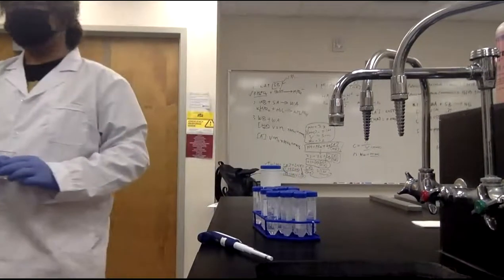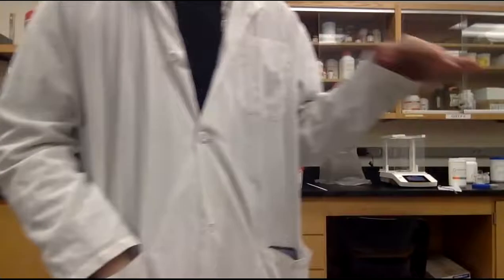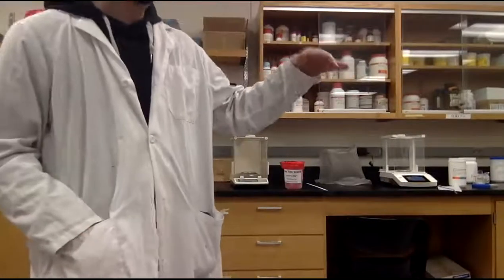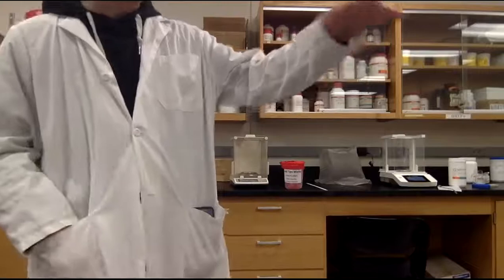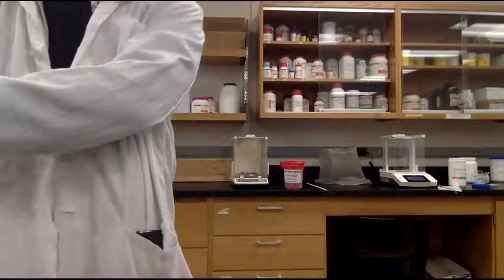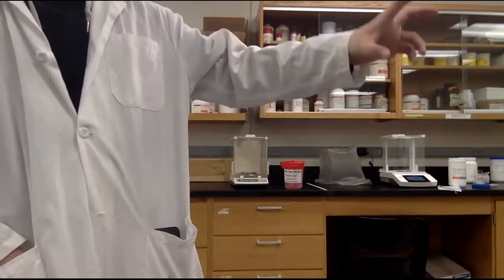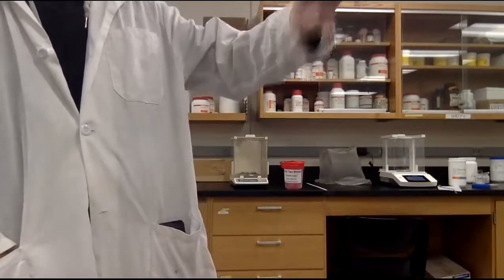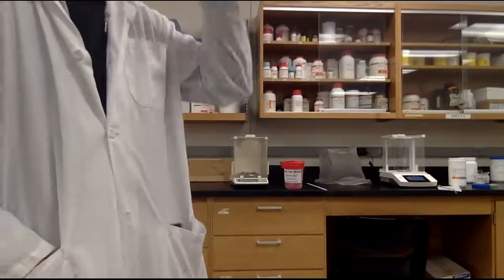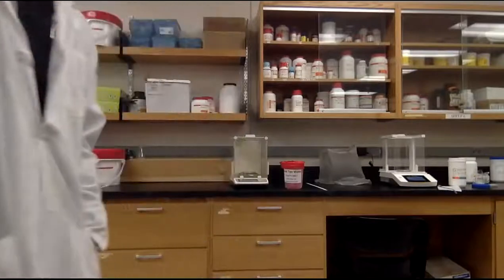So now you just start adding water to it until 50. You are not measuring the volume by the line of the beaker. What you need to do is add the water to about 40 mL on the beaker that you can read. Then you use the glass stir bar to dissolve all the powder in the solution. Then you pour all the solution into a graduated cylinder to measure the volume. Then bring the volume to 50. I see. So we just add up, and you have distilled water somewhere.